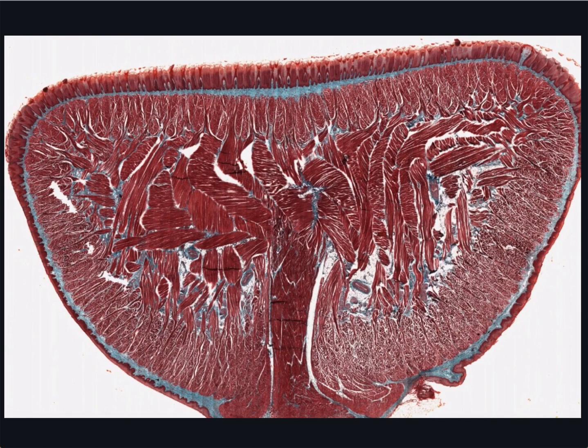This is a section through the tongue of a rabbit, not human, but they're both similar, and it's been stained with Masson stain. The organ's mainly skeletal muscle surrounded by a stratified squamous mucosa. Look at the very orderly arrangement of the muscle fibres in several directions, separated by connective tissue that stains a light greenish blue. This is what makes our tongue so wonderfully dexterous or flexible.